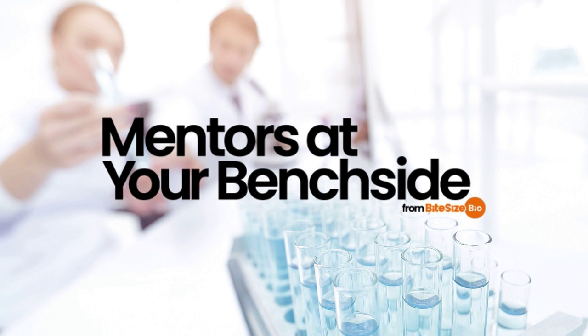The conversion factor for your spec, so the number of cells per mil represented by 1 OD unit, will be equal to the gradient of the linear portion of the curve, normally up to about OD1. You can now use this factor to convert your OD reading to cells per mil, and as long as you calibrate whatever spec you're using in the future, this number will be absolute and comparable between experiments, specs, and years.